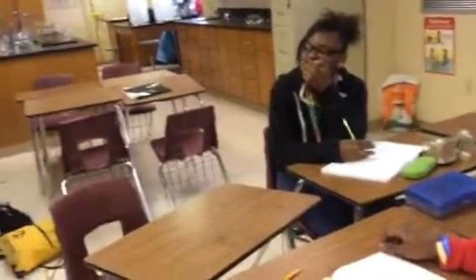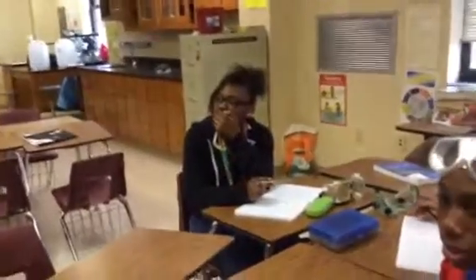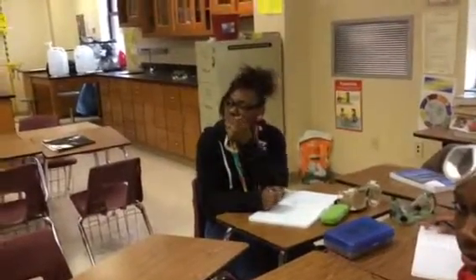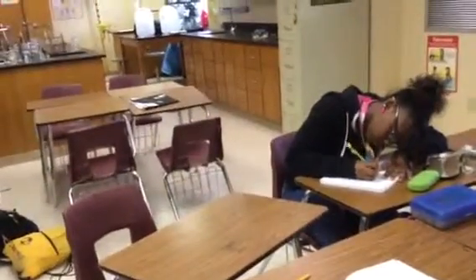Okay, so what do you hope to see? What do you think is going to happen after you add the enzyme to those things? It might change color. You might look for a color change. Okay, if you're talking about a chemical reaction, it could be a color change. What else could happen? It might rise up. Okay, rise up, and when it rises, what's going to be produced? Some sugar or something. The chemical properties of the sugar can change. Do you think you're going to smell anything? Yeah.